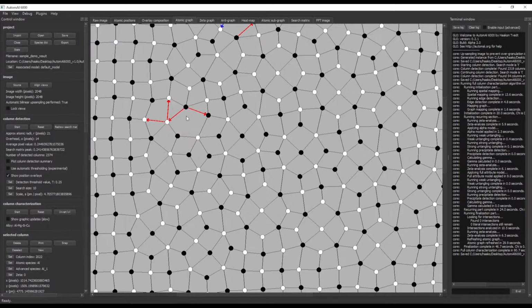But once you do get used to it, this will be a very quick process, because you'll be able to see things instantly, and just correct it, and then you have your result. But I'm going to try to take it very slowly here, and I'll try to explain what all this means.